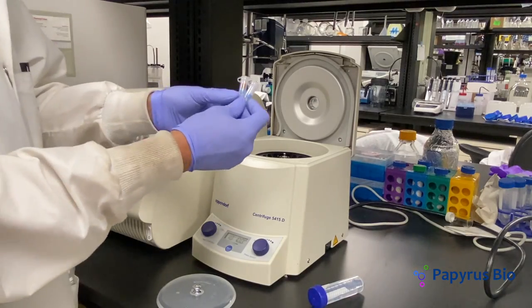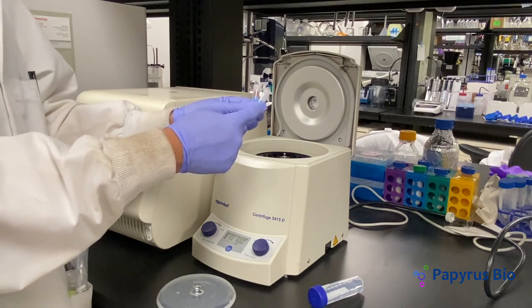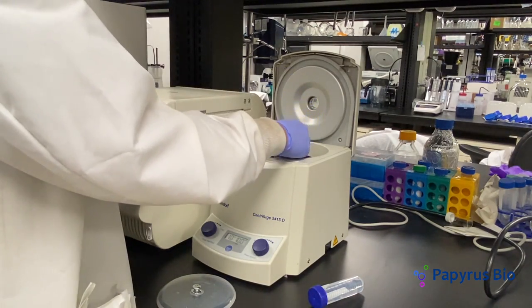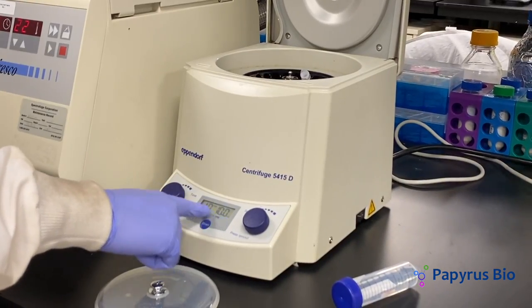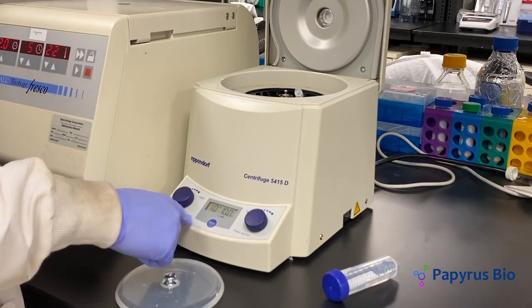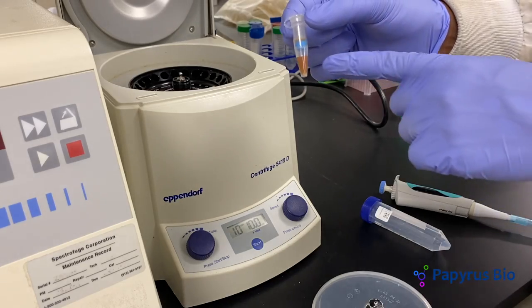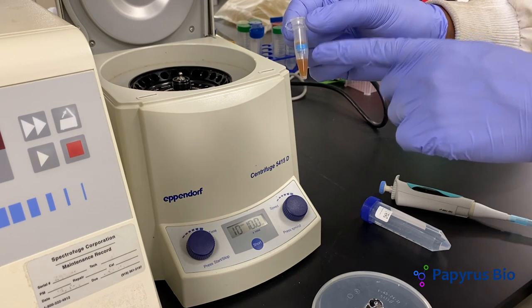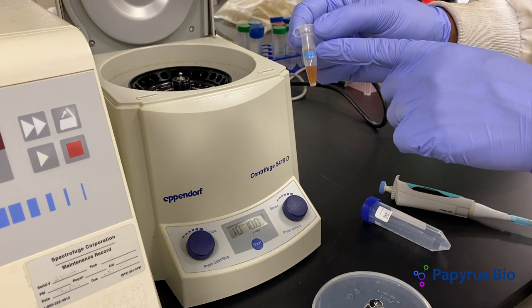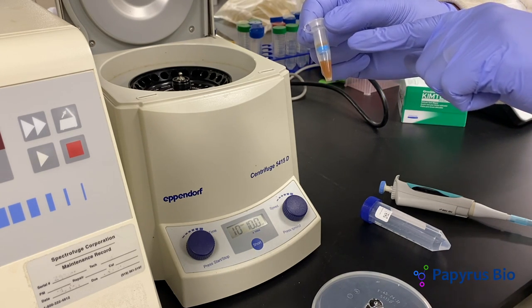Next, we have to centrifuge the filter tube. To learn more on how to use a centrifuge, click the link above. Spin the protein at 10,000 RCF for 10 minutes. Any buffer molecules or salts that are smaller than the molecular weight cutoff — which is 10,000 for this filter — will filter through, while larger molecules will be retained above the filter.